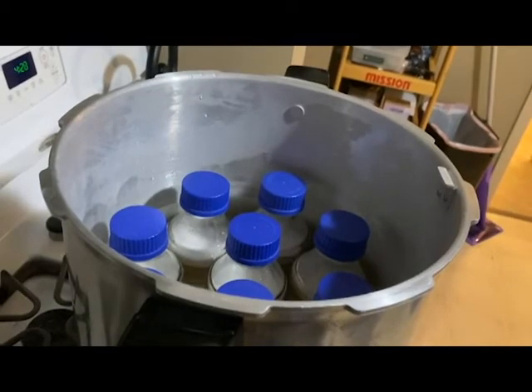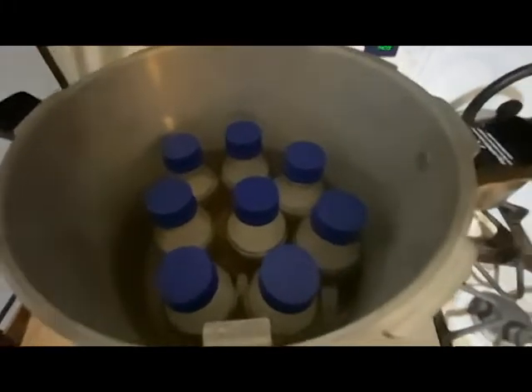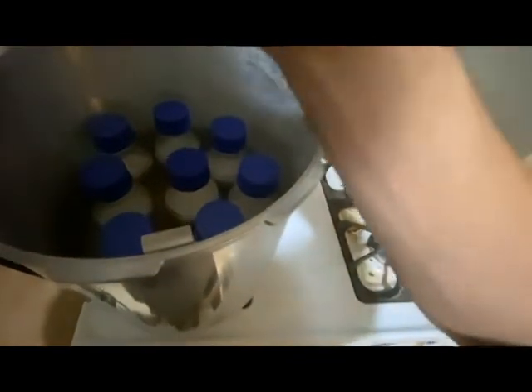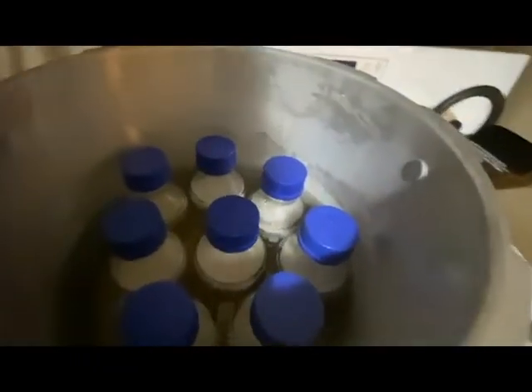So a real common situation people run into when pressure cooking agar is that the agar inside has the tendency to boil over and seep out of the bottles into the pressure cook water, which is kind of annoying sometimes. You'll pull it out and the level would be down to 300. So you lost 100 milliliters worth of agar solution within the pressure cook water.